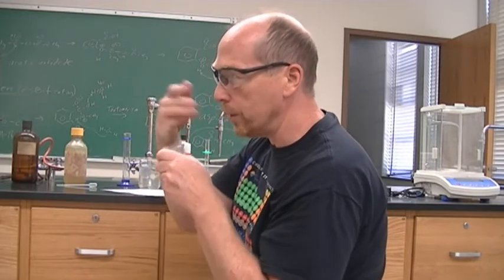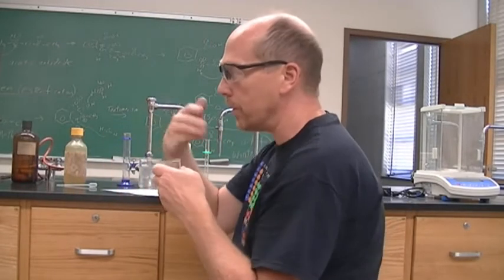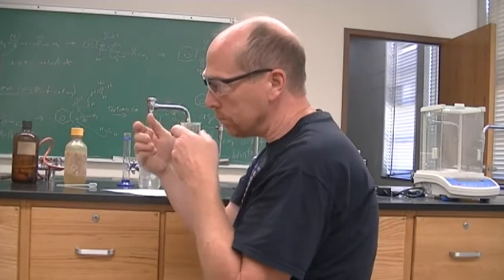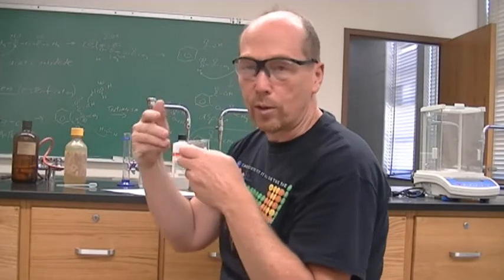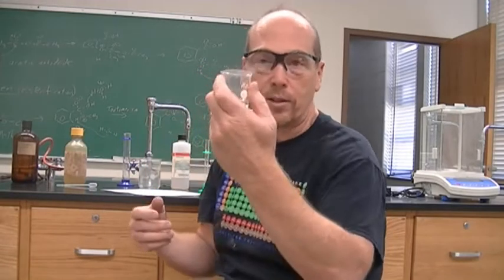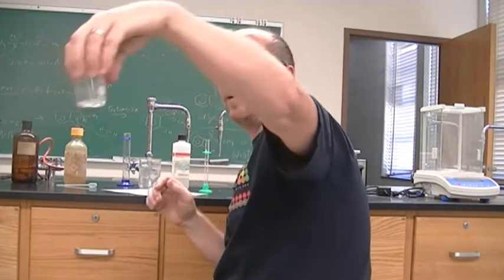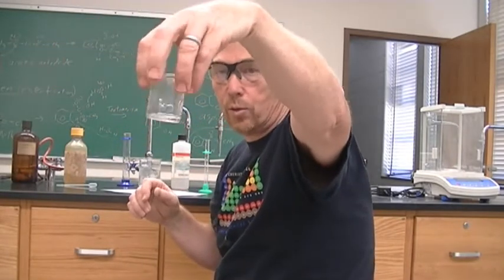oil of wintergreen smell. So I should have made this first before I made the soap, and then I could have added this to the soap and had some oil of wintergreen flavored soap. So I know that it's oil of wintergreen. I'm going to stick my nose right in there. Anyway, it's a nice wintergreen smell. So again, there's not much that you can see on a video. This was mainly for you to smell the oil of wintergreen.